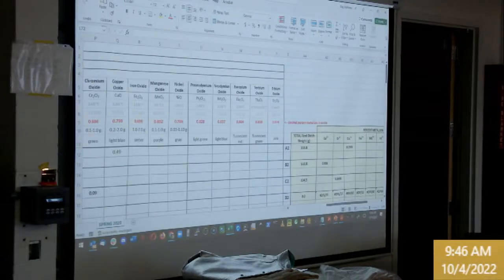And that's going to fire polish and get any imperfections from the pour to just sink into that glass until it's nice and smooth, like a perfect little disc. The hottest part of the flame is that you'll see four bright blue inner flames, right at the tip of that level of the inner flame.